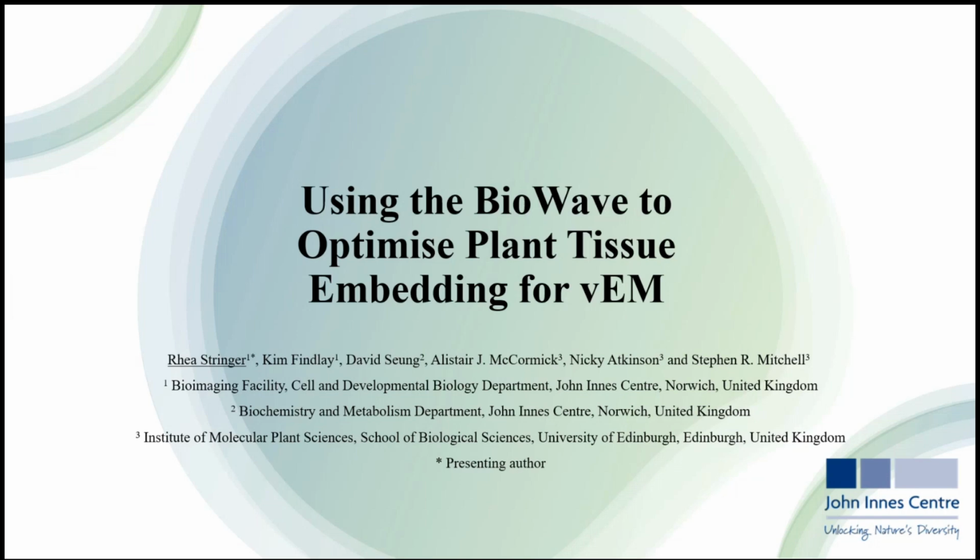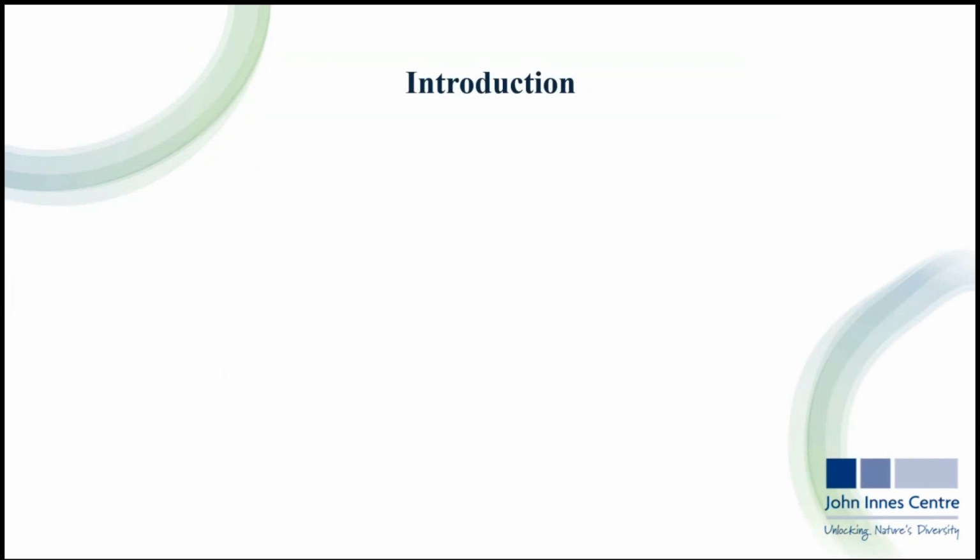Okay, so hi everyone. As I was kindly introduced, I'm going to be talking about the use of the BioWave to optimize plant tissue embedding for volume EM. Before diving into the details, I'd just like to briefly introduce the main goal of the work.